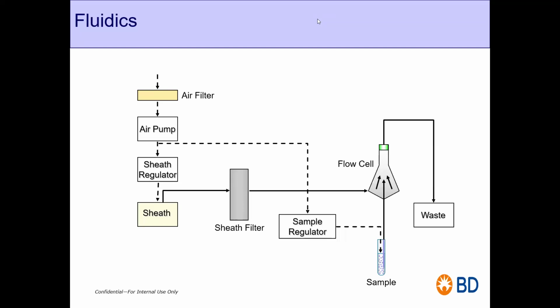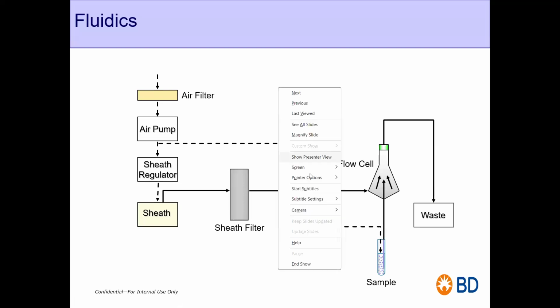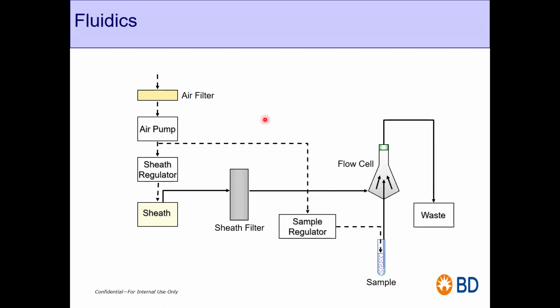So I want to congratulate those who have taken the option of sample pressure. Now, why not sheath pressure? Many of them are thinking of that as well. Let me tell you why not sheath pressure and why the sample pressure. Can you see my screen? Yes, yes. So why not sheath pressure? Why sample pressure?